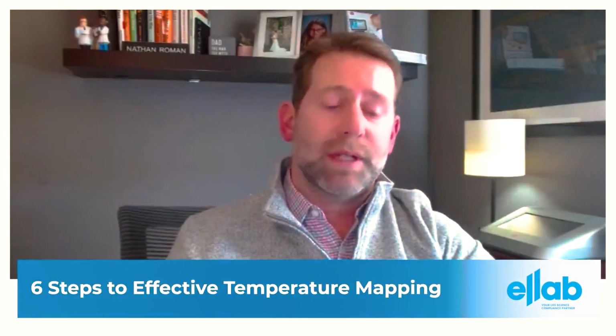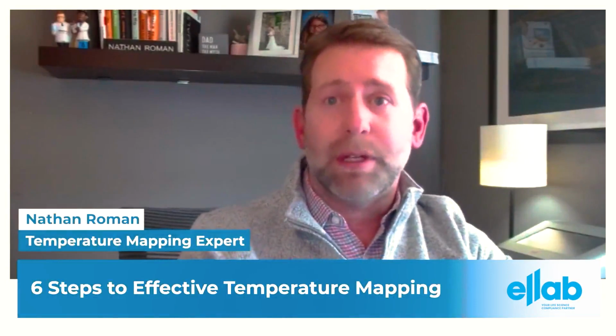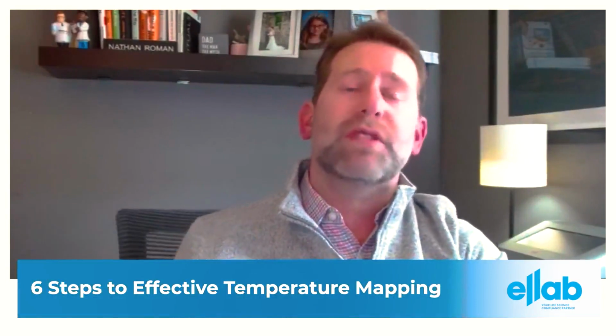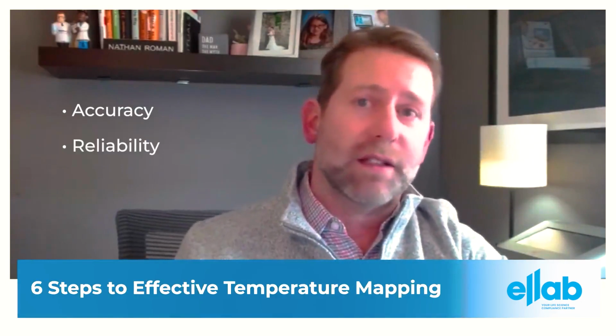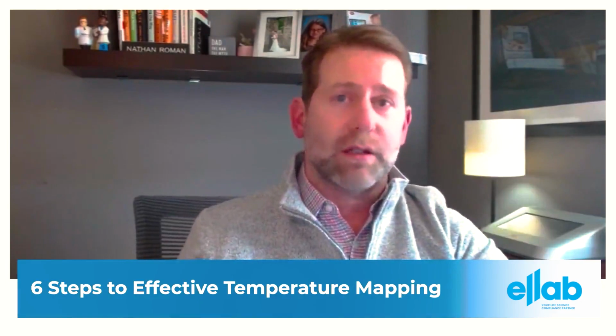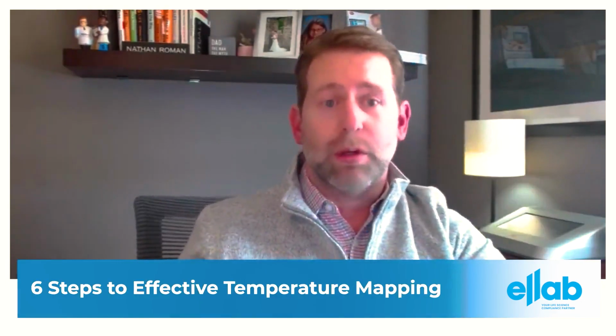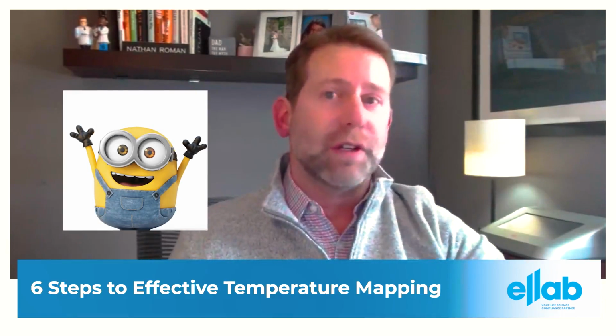Proper sensor placement is key to accurate and effective temperature monitoring. As detailed in the 6 steps to effective temperature mapping, sensor placement is a pivotal step that ensures the accuracy and reliability of the data collected. So sensors are going to act as temperature detectives, or temperature spies, if you will. The minions come to mind, capturing critical variations across the environment.